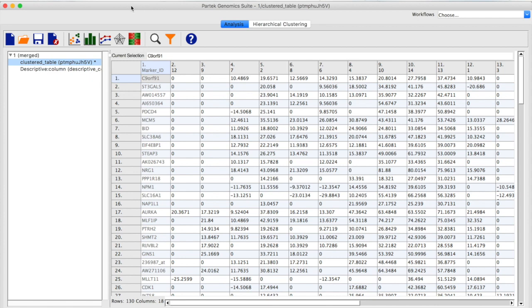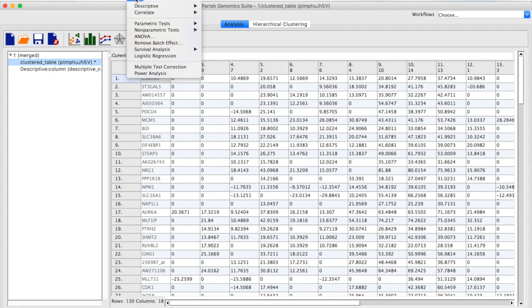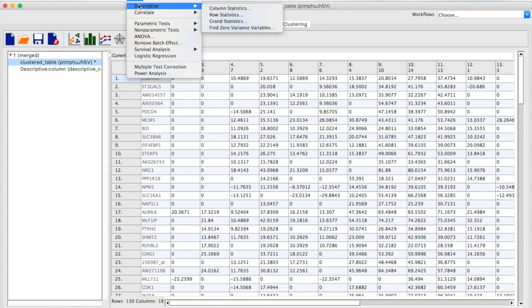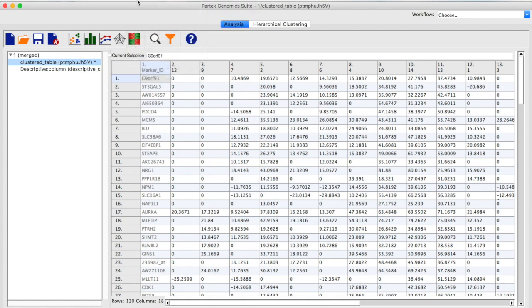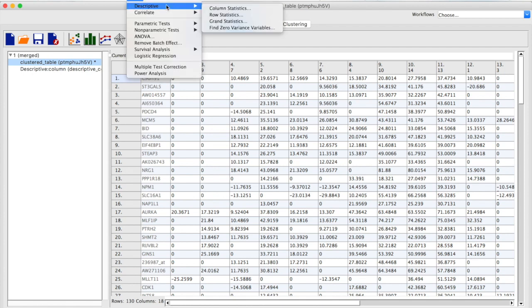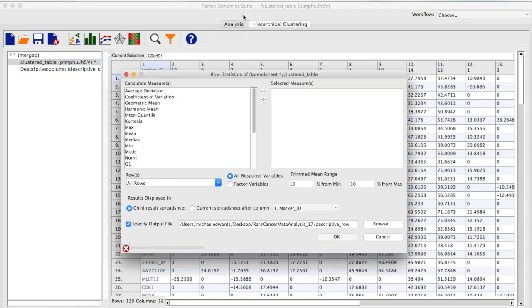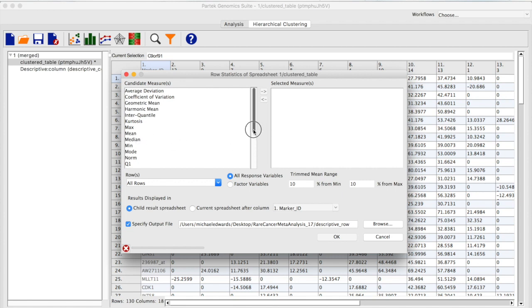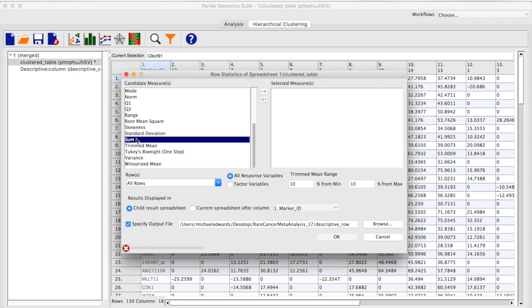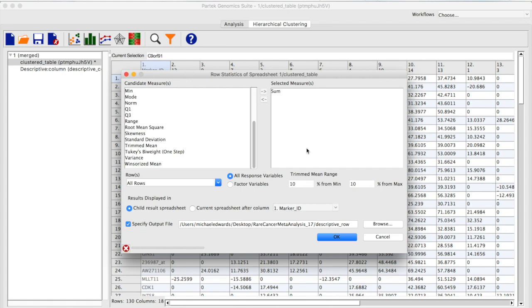We just go to Partek Genomic Suite menu, and we select Stat. We then go to Descriptive, and I'm going to select Row Statistics. You could take the mean or the median of all that fold change information, but what I'm going to do is take the sum of all that fold change. That's going to be my representation of not only the direction of where these genes go compared to the control, but the magnitude of that. So I'm going to select Sum. I want that in a child result spreadsheet, and I'm going to hit OK.